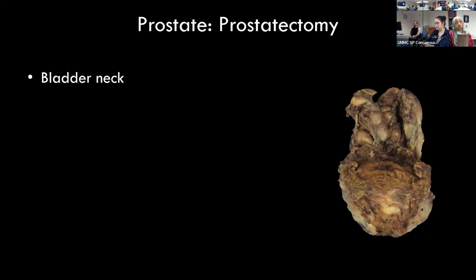So this is a typical prostatectomy specimen that you will see. This thing is facing this way. On the posterior aspect, you have the seminal vesicle and the vas deferens. So that's the bladder neck area, and this whole part is the anterior fibromuscular tissue, okay? You can see in the bladder neck area, it looks like a crater.